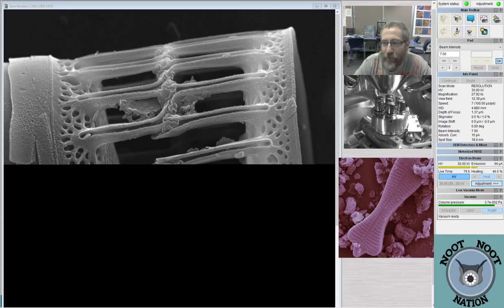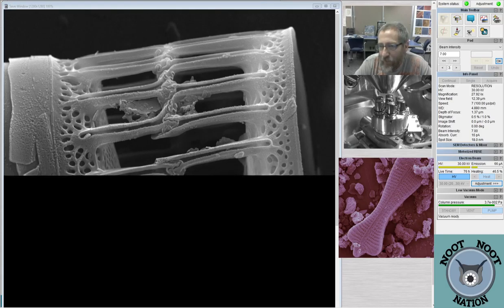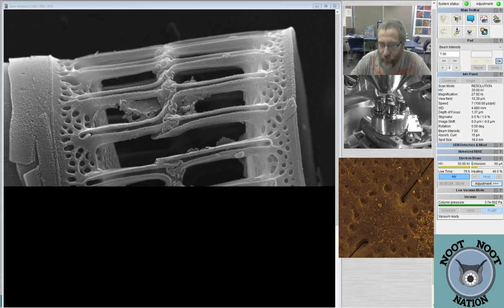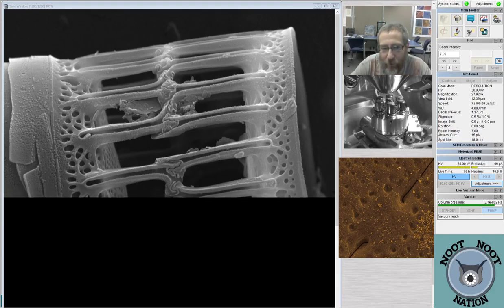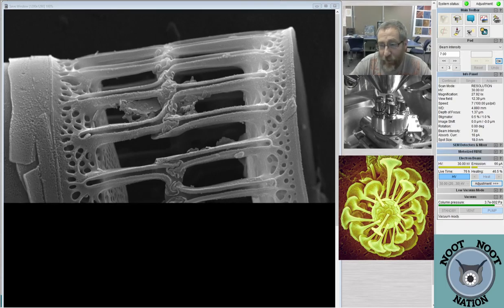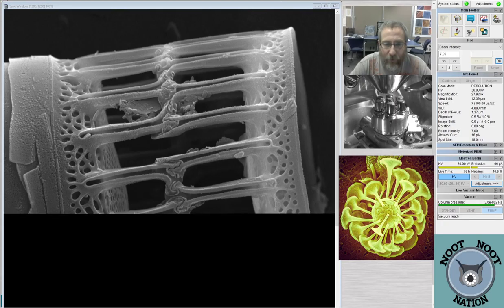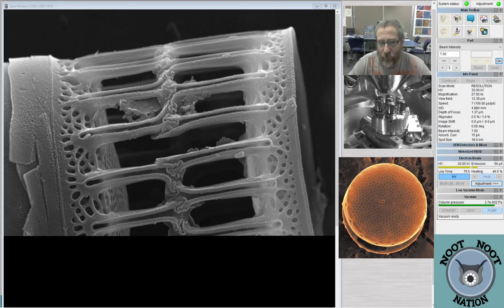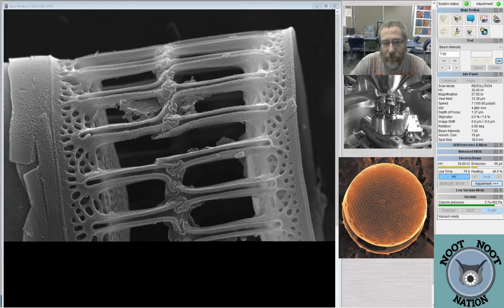Yeah, it's totally fine. Ask questions about whatever you'd like, Moonlin. So for diatoms, normally what I would recommend is that you go to diatoms.org, which is a website where they will sort of train you if you go through and read stuff on how to identify diatoms. It has all the glossary attached to it with pictures, so you could learn a lot of it. And it's where I point my students when we first start training them on learning diatoms.